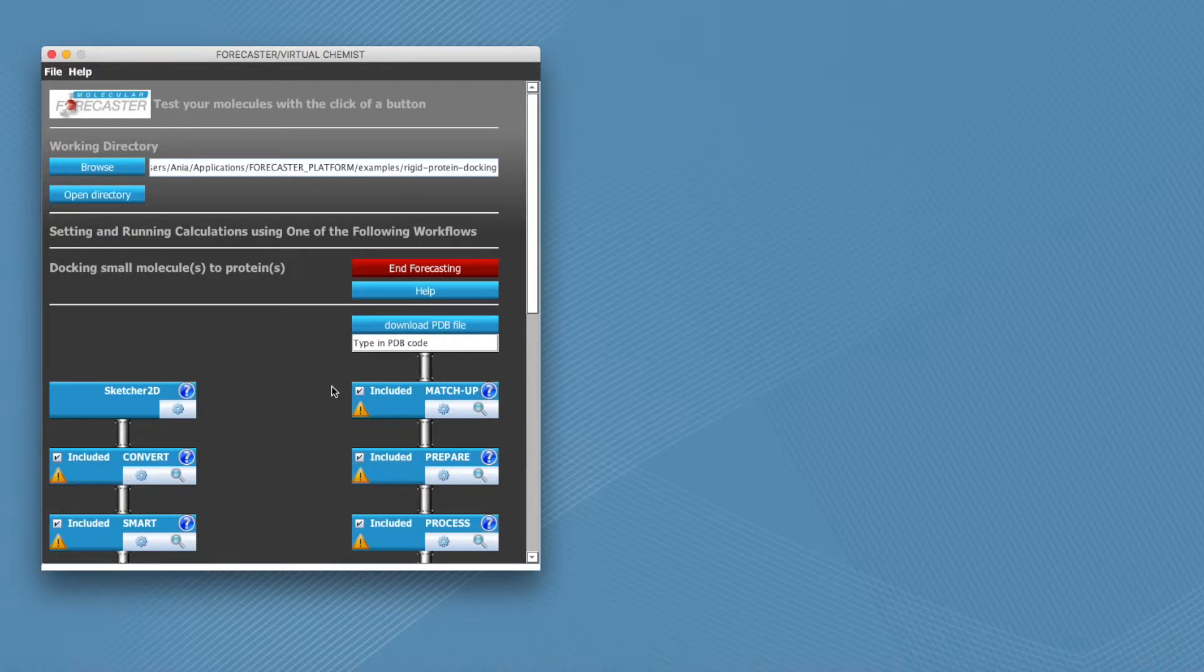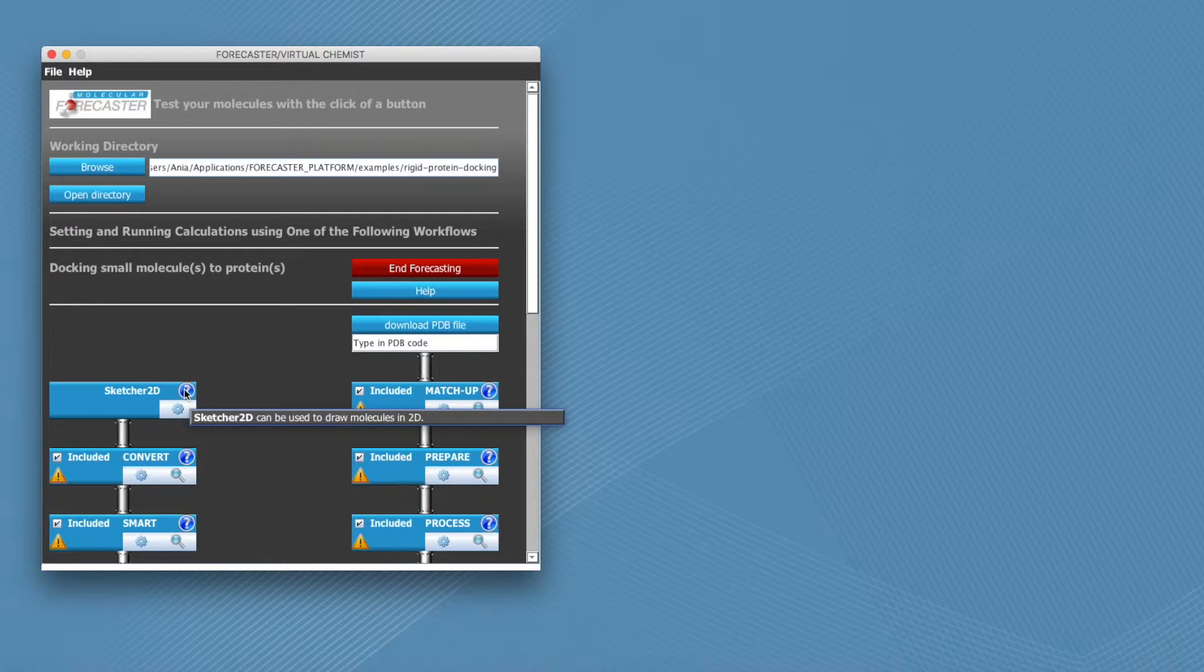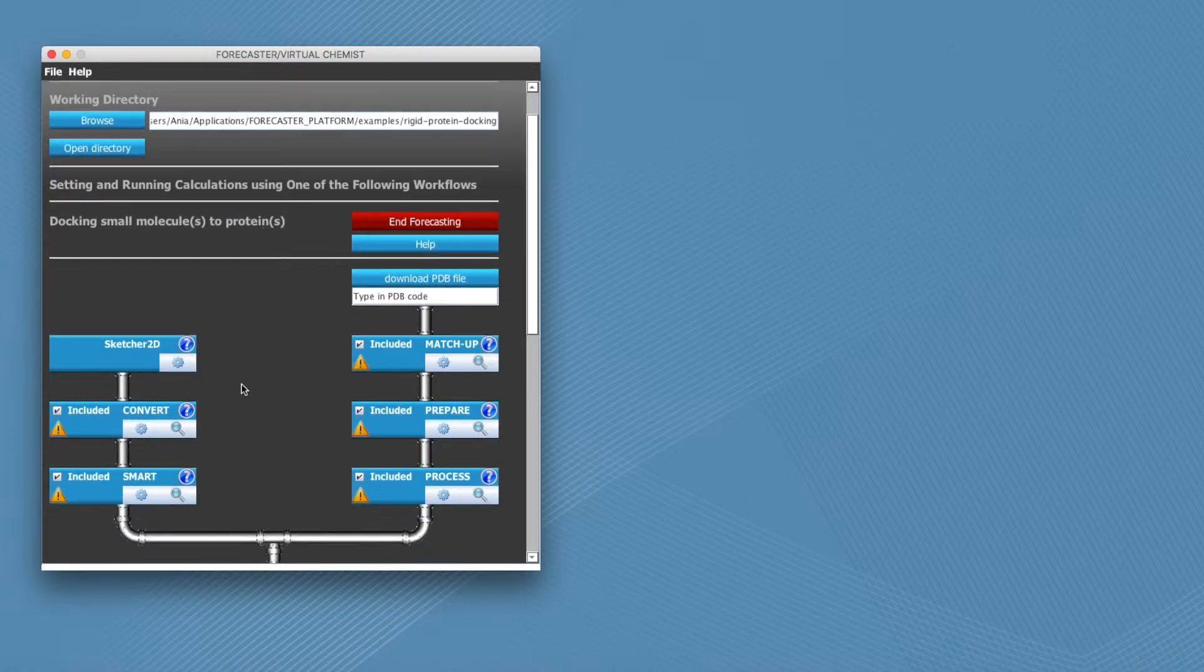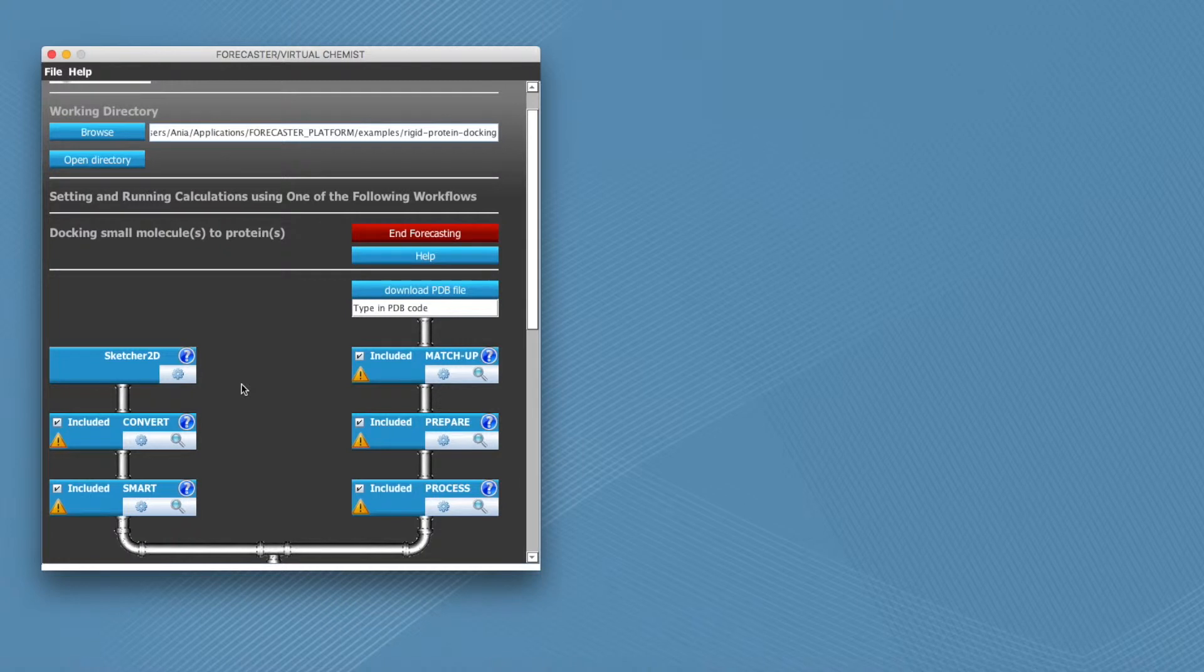The necessary modules will appear. By hovering your mouse over the question marks, you can see additional information on each module. You can also exclude unnecessary elements from the preset workflows.